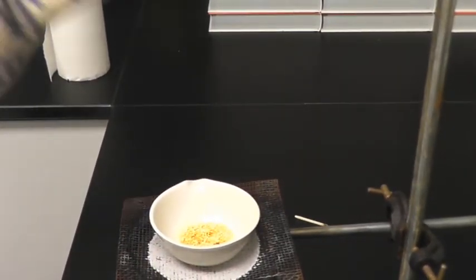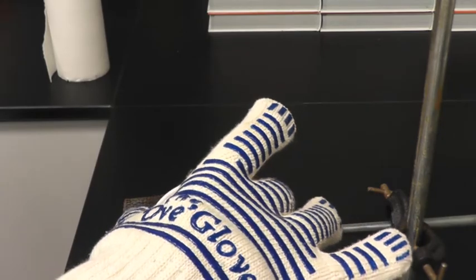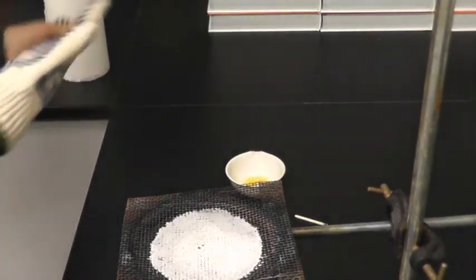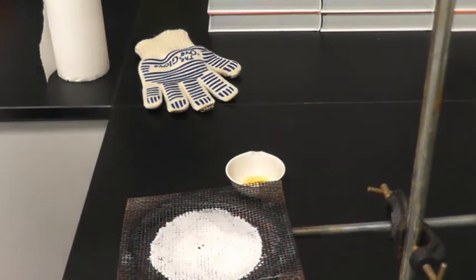But I'm going to pick this up, and I'm just going to put it right on the counter, and from here, we're going to let it sit for about 5 minutes to cool off, because it needs to be cool before we weigh it, all right? So essentially, let it cool.